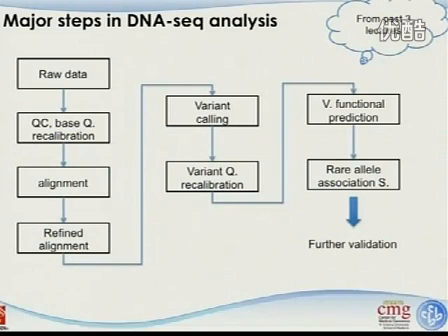And there are multiple ways to do that. And remember, if it's a diploid genome, which means for human, for example, we have 2 chromosomes, one from mom, one from dad. And if they are reasonably balanced, half-half, then we can just use SAMtools to do that. It's pretty good.